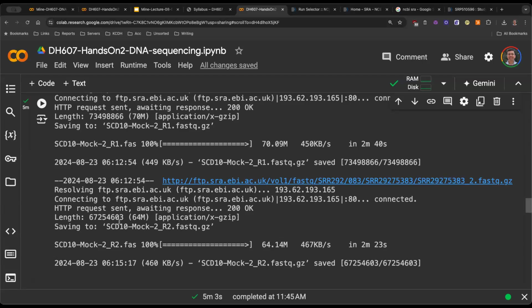But in the case that the fragment truncates before 150, what it will have to do is say, okay, I don't have any other option, let me just go ahead and sequence this adapter as well. So this thing is your adapter. The adapter is actually on both sides. The adapter has a complementary strand in terms of what you're actually sequencing. Yes. Okay, so I'm jumping somewhat.